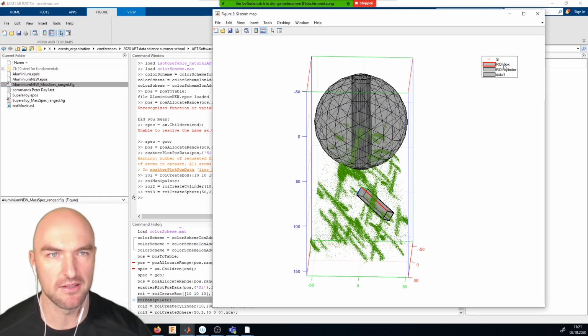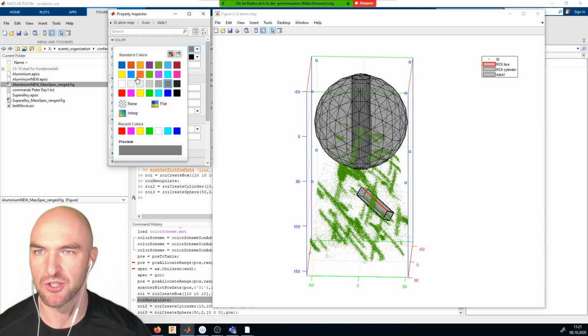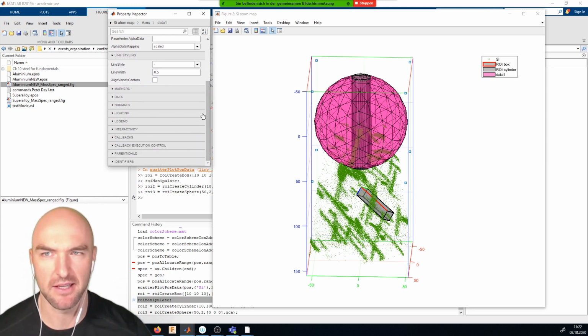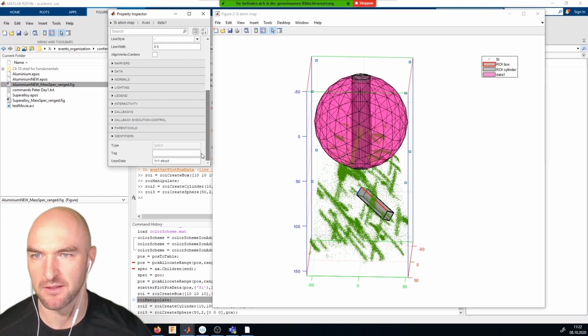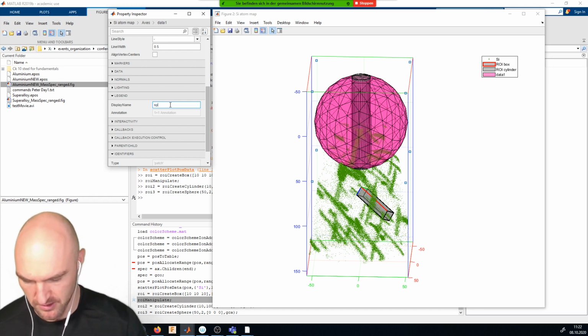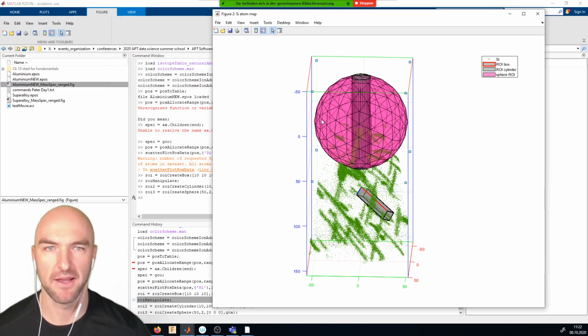And if I go on to the legend, you can see all of them are gray now, so we should probably change the color of that ROI. Maybe we'll change it to something greenish or something purplish. My color selections are always really bad. And then you can see which one is which. And I don't know why the sphere doesn't have a name. We should fix that. So note that there's a bug, because the display name should be set. And here the display name, we can just call it sphere ROI. Yeah, so now it's called sphere ROI. And so on and so forth.